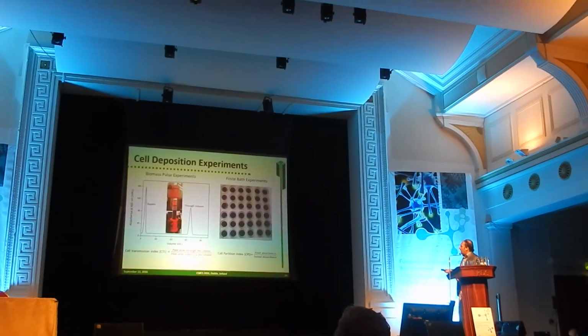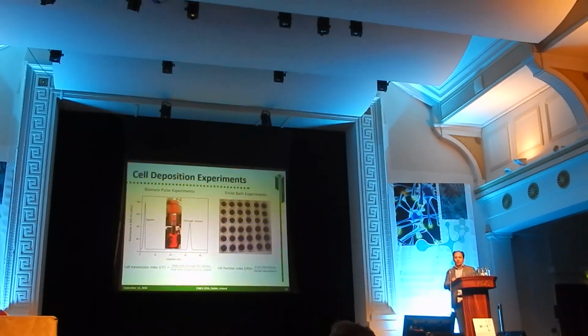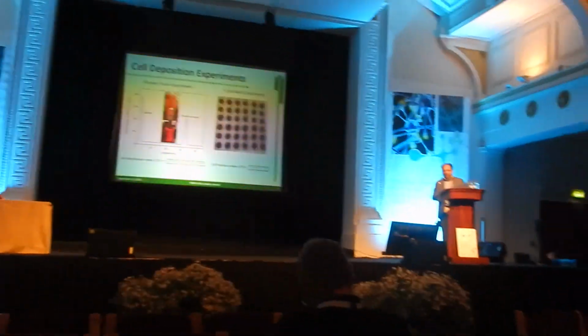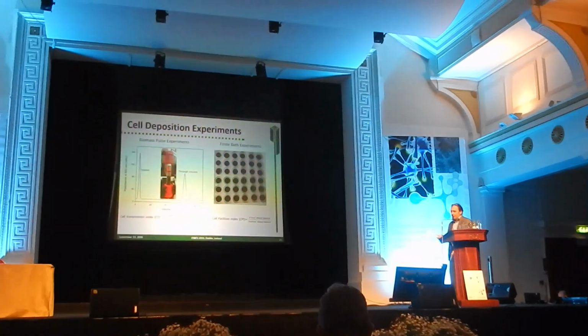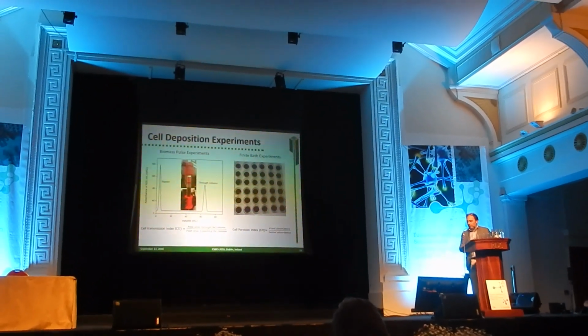And on this side, there are small wells in the microwell plate, right? Where you have the adsorbent particles and the cells, and you basically measure the supernatant after some contact time, and you see how many cells remain in the supernatant. The more cells that remain, the less interaction you have. This we call the cell partition index, and to a certain extent, these two techniques are good.